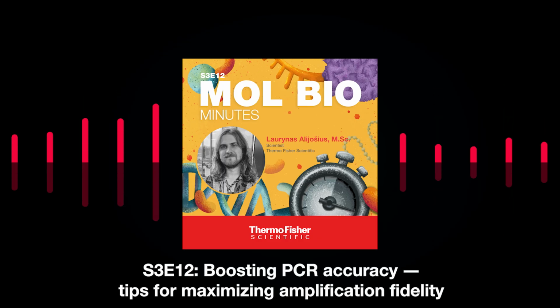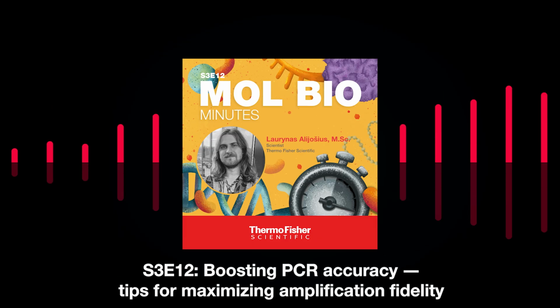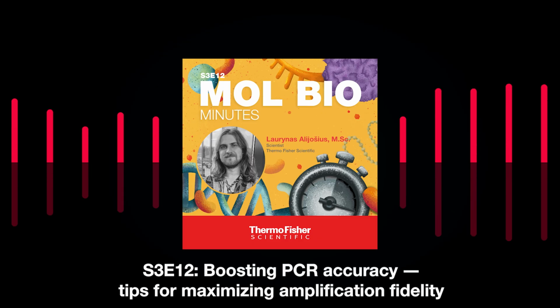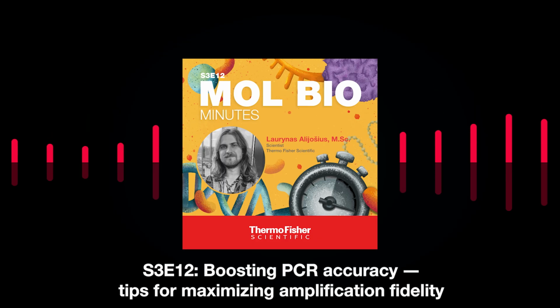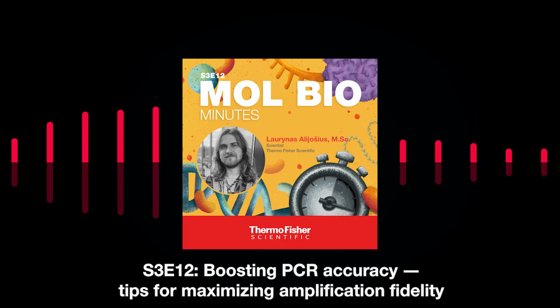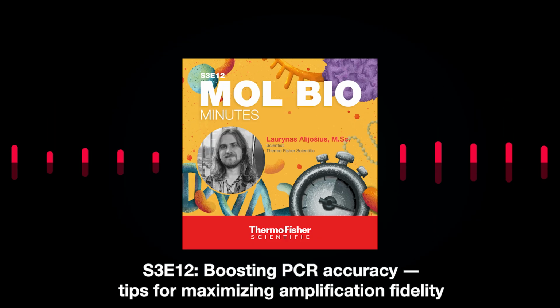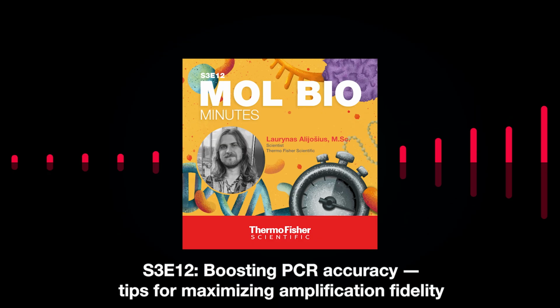Accuracy suggests that there will be fewer errors introduced during your PCR reaction, so automatically you will have higher confidence in your results, and that's great, right? Having low numbers of errors is important for some methods. Let's take, for example, sequencing. It's very important to have the correct amplified sequence for sequencing experiments such as de novo sequencing, or if you're sequencing your samples after you perform mutagenesis experiments.